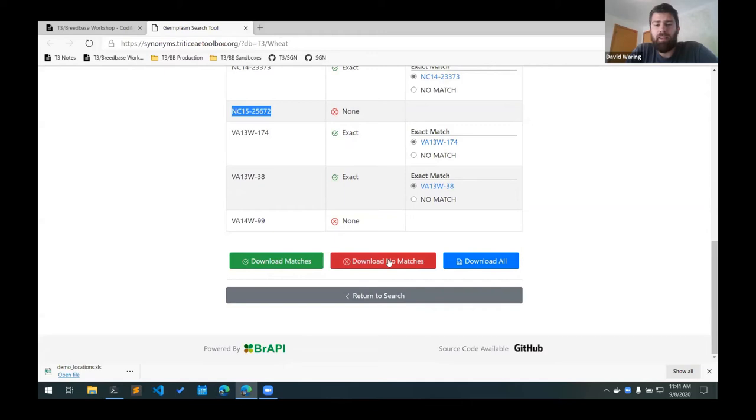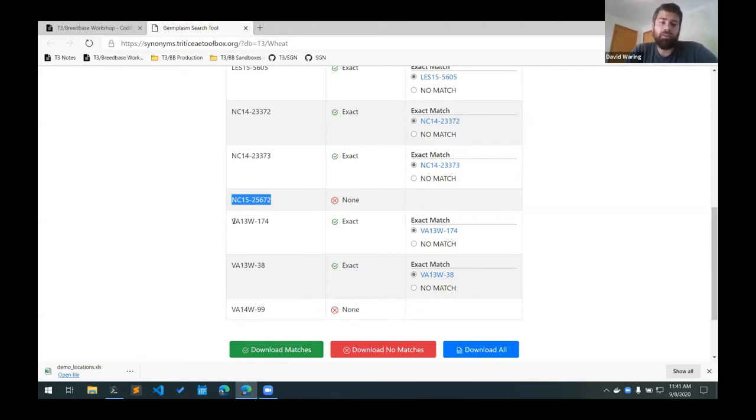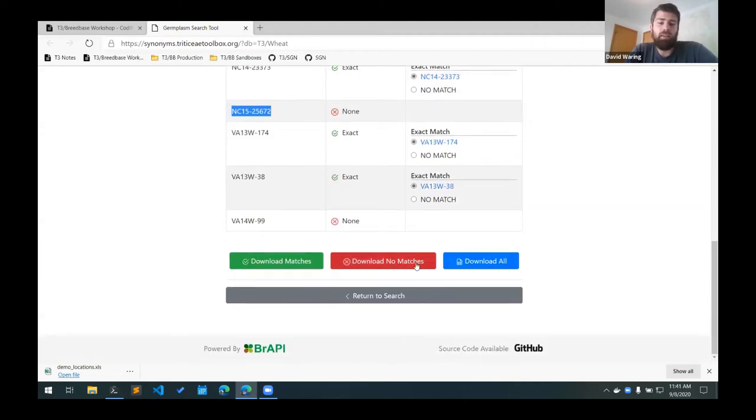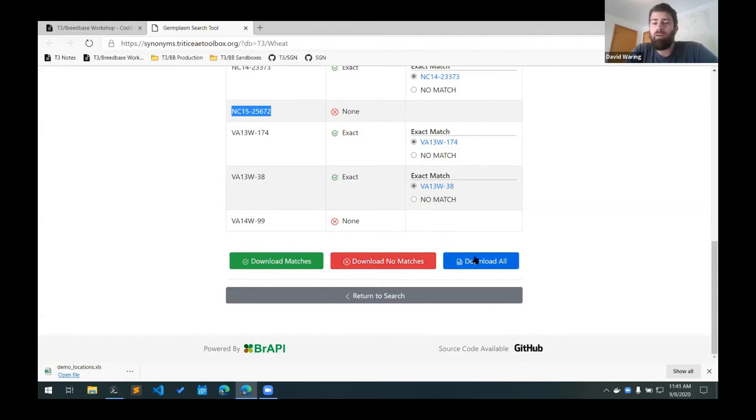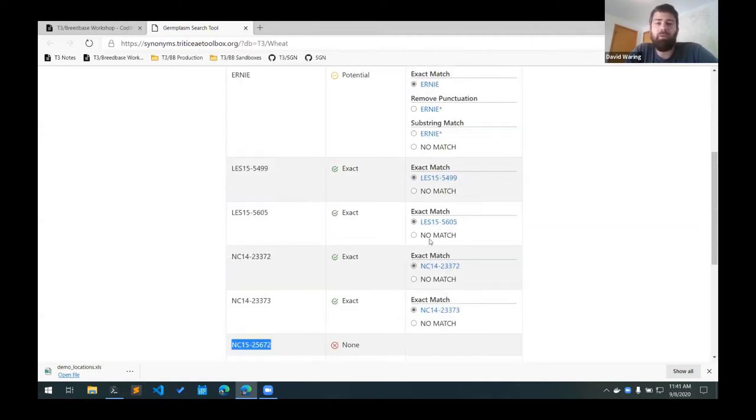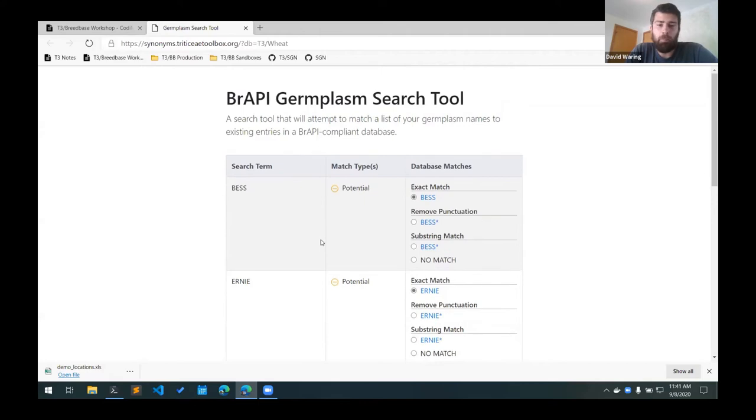And then there's some buttons down at the bottom here where you can download different tables. This first one will download a table of the matches. So we'll have your search term with the selected match database term. It can also download all the lines that don't have a match. And then the download all button will download a version of the table that's displayed in the website here.